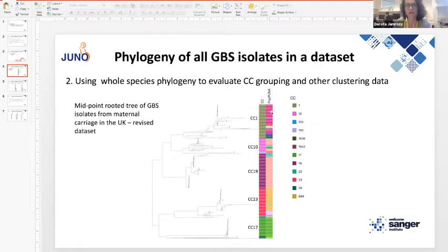In terms of PopPUNK, there is some variation there, but it's not necessarily a red flag. It just means that PopPUNK detects some heterogeneity within that group that MLST doesn't, and that's basically the nature of MLST analysis versus PopPUNK analysis.